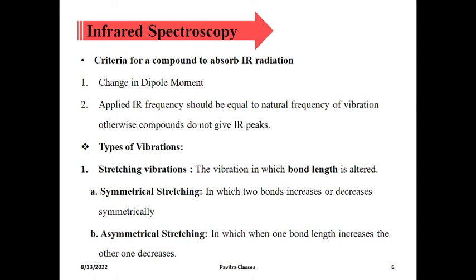It is also very important that the applied IR frequency should be equal to the natural frequency of the vibration. Otherwise the compound will not give the IR peak. Only when the applied IR frequency equals the natural frequency of vibration of the molecule does it give the IR peak. There are many types of vibration in the IR, majorly two types: stretching vibration and bending vibration.